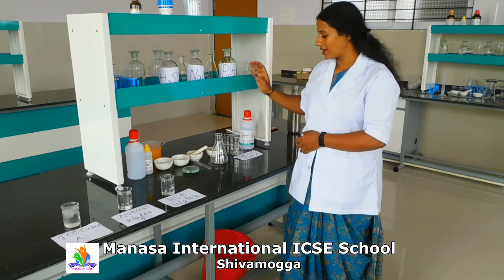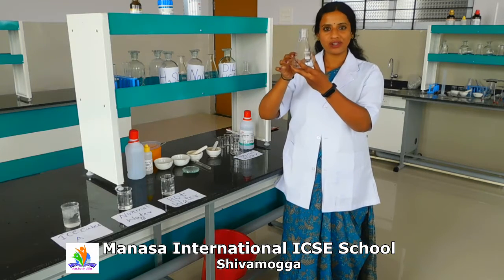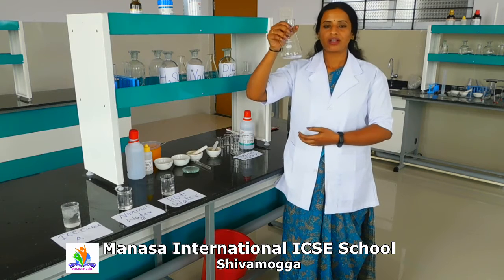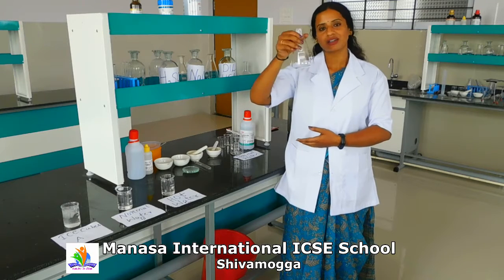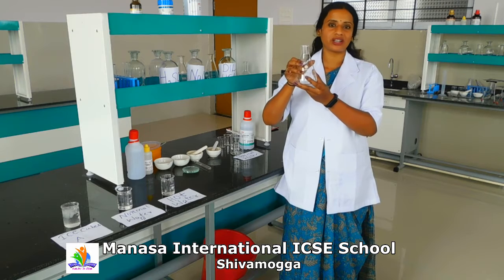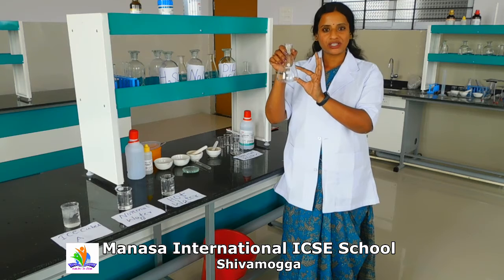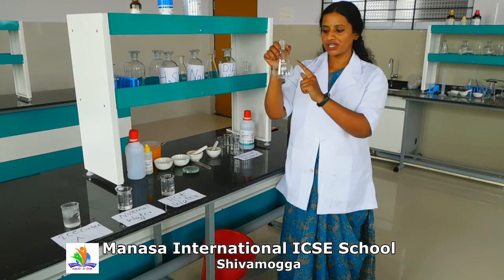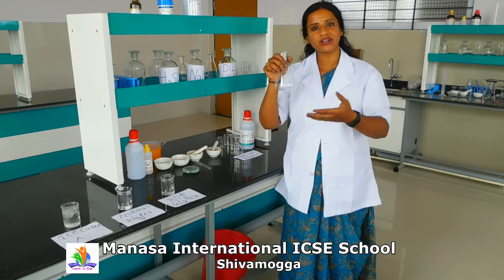The next apparatus I am going to explain is the conical flask. This conical flask is made of borosilicate glass. It can withstand temperature changes, because in most reactions we may heat, and there are instructions given to heat. All this changing temperature, borosilicate glass can withstand. And we have the measurements here, that is 250 ml. Graduations are given as 250, 200, 150 and 100 ml. According to that we perform different reactions.